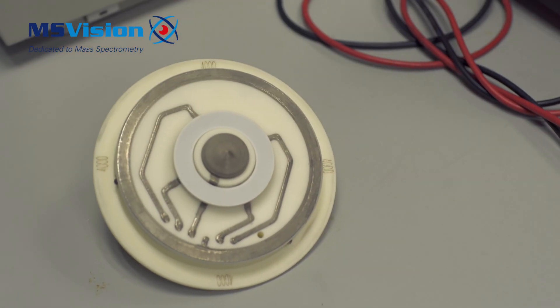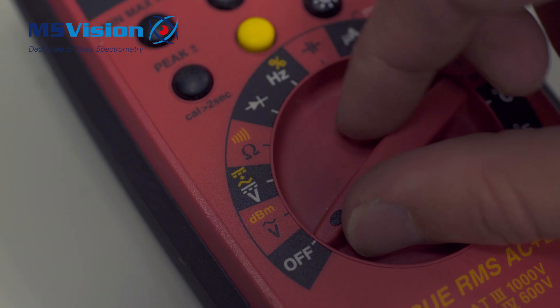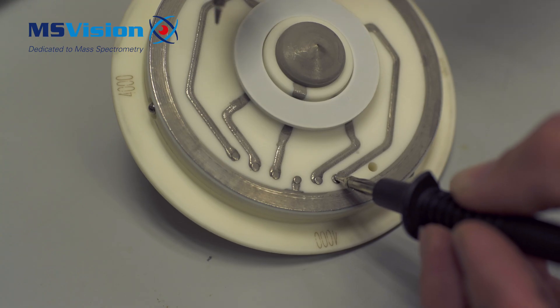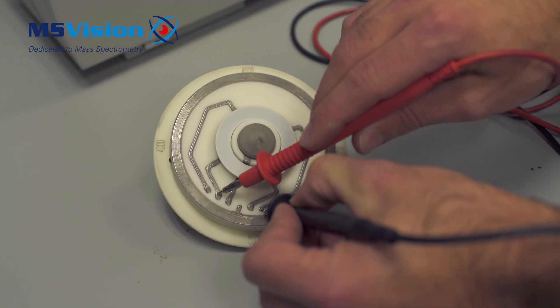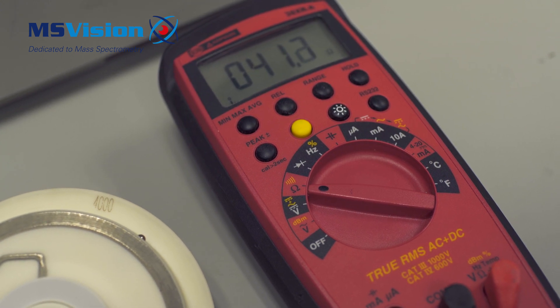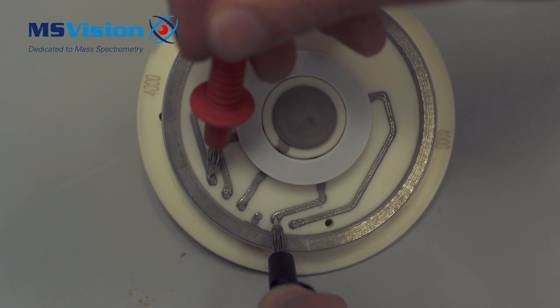The points are numbered 1 to 6 from the bottom to the top. There are two measurements to be made: the heater and the sensor. The sensor is points 1 and 5 with a resistance range of 45 to 55.5 ohms, and the heater is points 2 and 6 with a resistance range of 33.75 to 41.75 ohms.